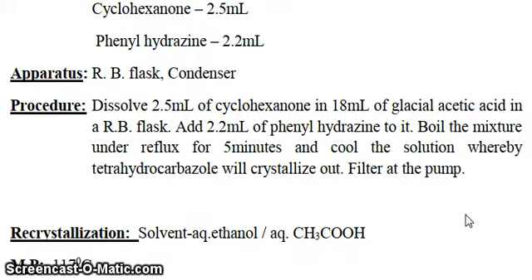Boil the mixture under reflux for 5 minutes and cool the solution, whereby tetrahydrocarbazole will crystallize out. Filter at the pump. You can do recrystallization with aqueous ethanol or aqueous acetic acid and check the melting point, 117 degrees Celsius. So friends, in organic chemistry, without mechanism, nothing.